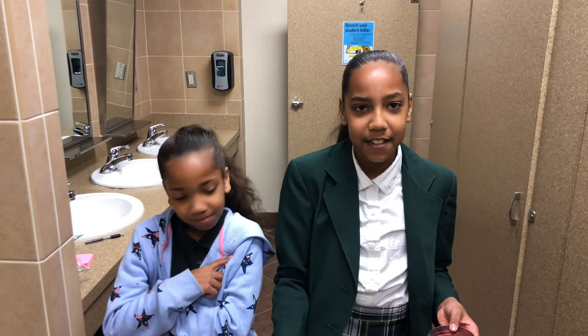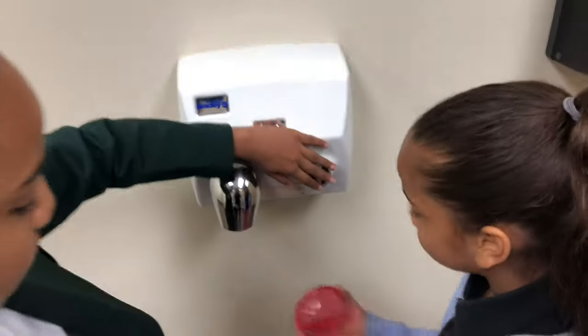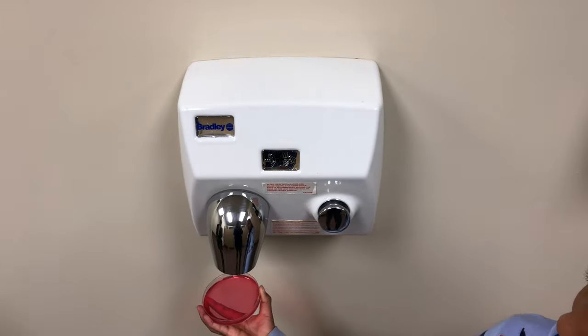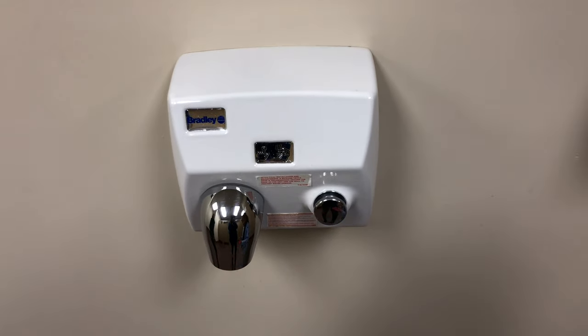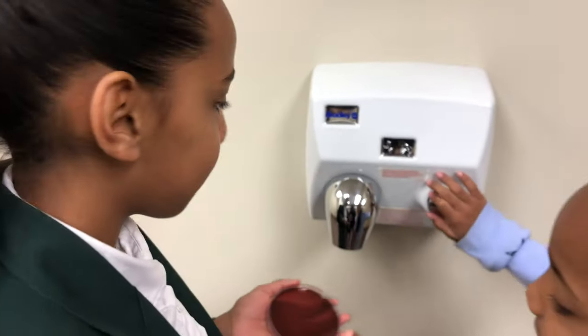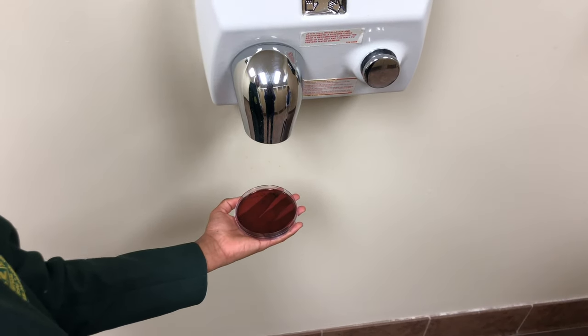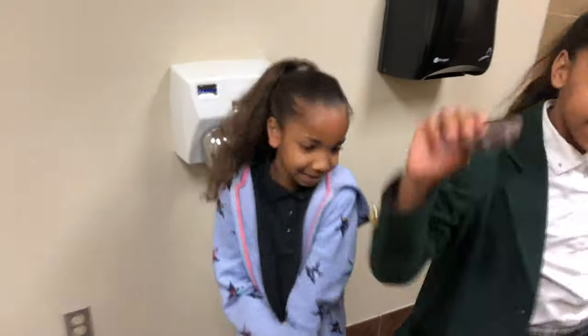So let's get started. What we're gonna do is open this and put it under the hand blower over there for 30 seconds, then we wait. Let's do it. Okay guys, you go first. It doesn't have any dots anymore — it never had dots.